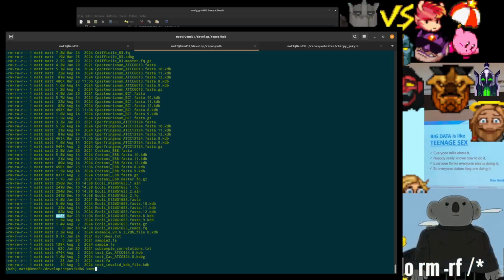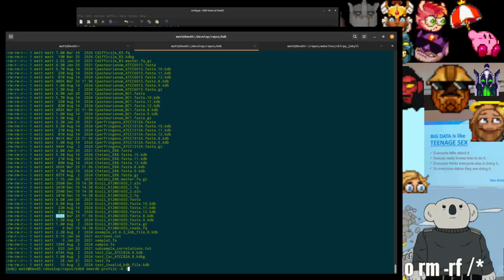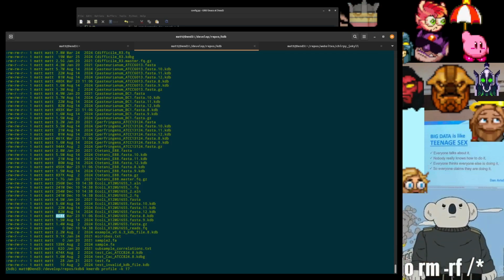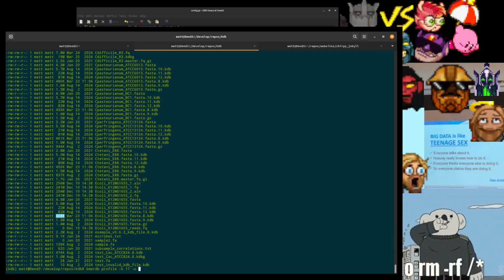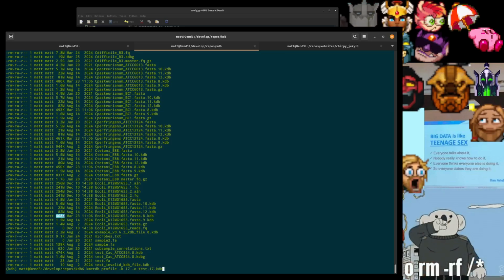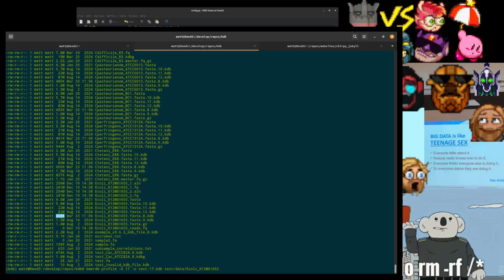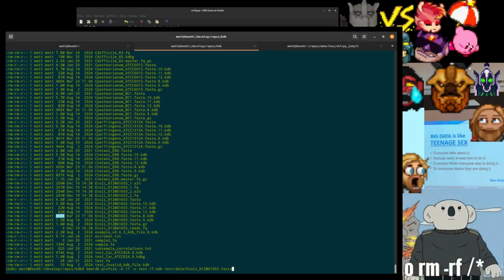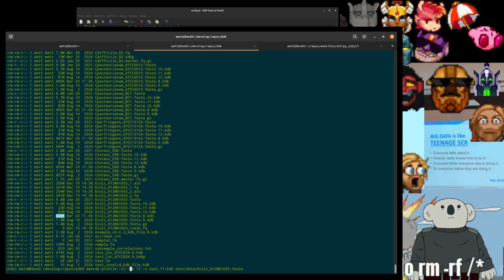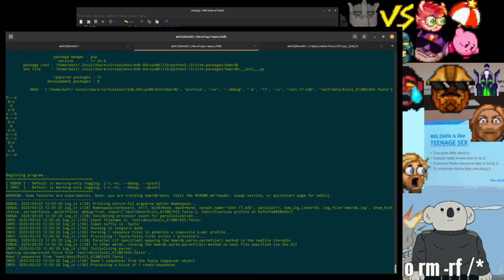And let's try this. Let's do k of, why not 17? Because I'm feeling loosey-goosey. Test.17.kdb. Test. Let's do E. coli. Matter of fact, we will view it with verbosity and the debug options.